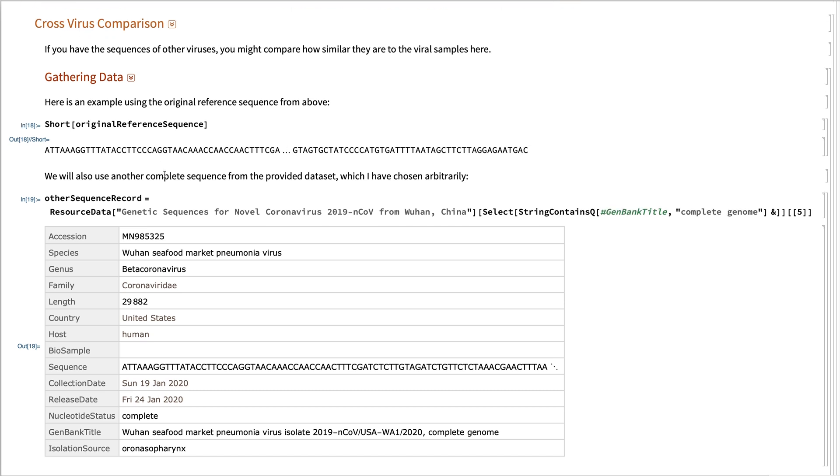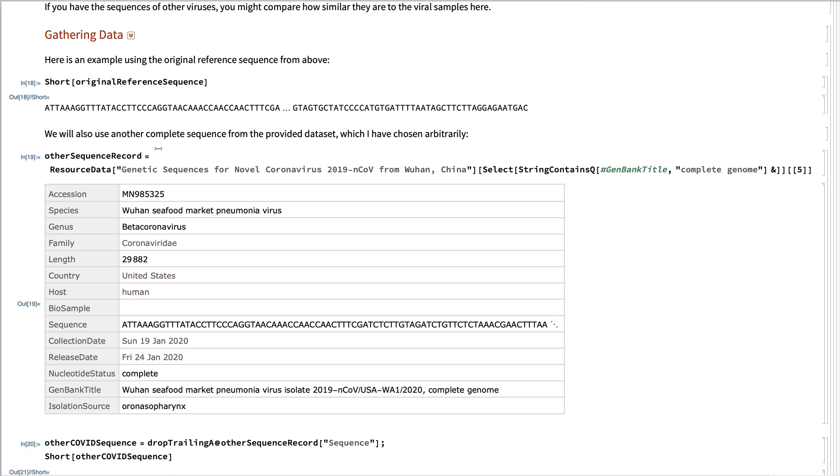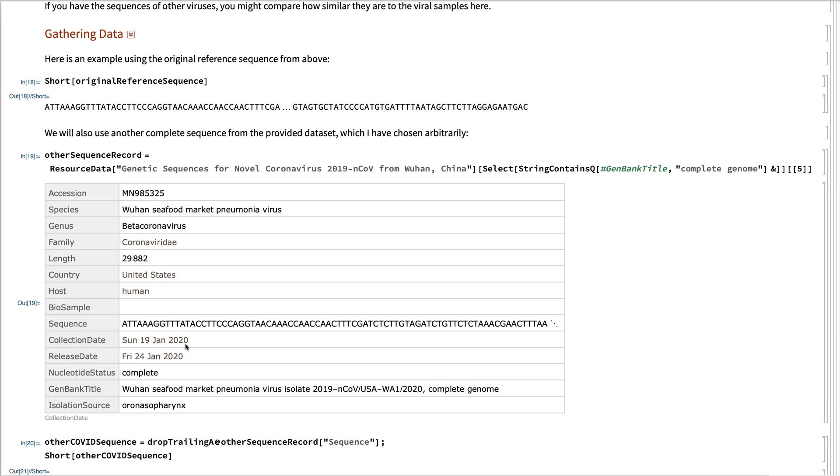And we're going to compare that with another sequence record I've chosen arbitrarily here. We just happened to see it was in the United States, collected about the middle of the month on January.